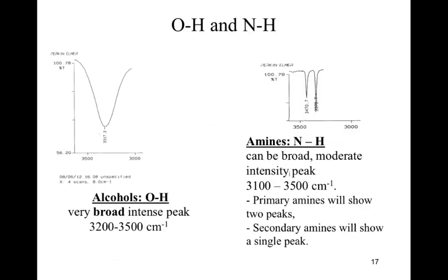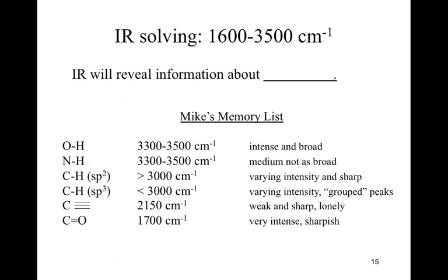Okay? So before we even get into what they look like, let's evaluate the sections that I think are going to be critical for you to memorize. So on this slide, we've got individual bond types listed on the left, so we know what bonds we've got to work with. We've got the wave numbers. That's a W, by the way. I know that looks a little confusing. Our wave numbers, and then we have some description of the signal. Okay? Words are pretty awful. A picture's worth 1,000 words, so we'll look at some pictures a little bit later.